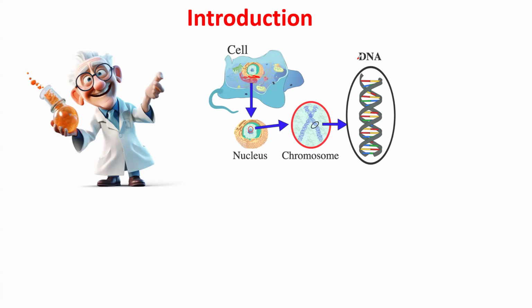That is, to get the DNA in a highly purified form. For you to do that, you need to remove all other components of the cell, and it is only the DNA that you require. So in this video, that is what we are going to look at.